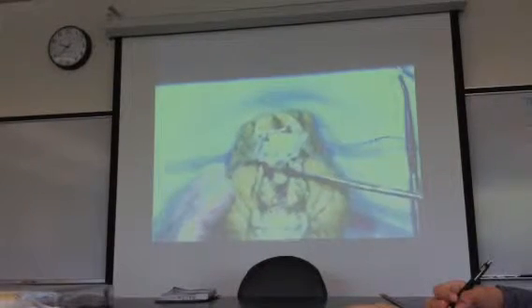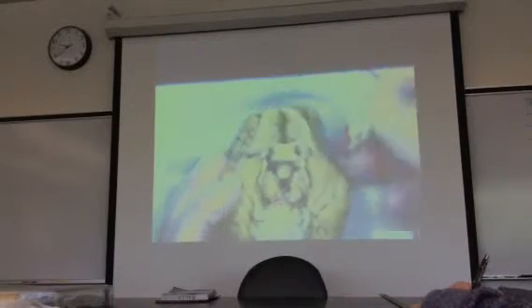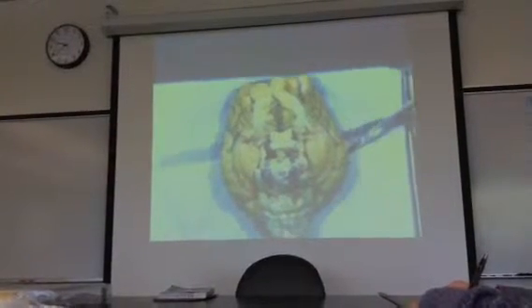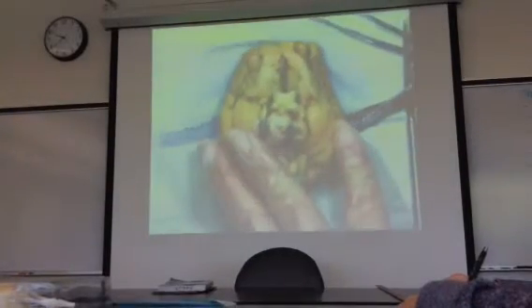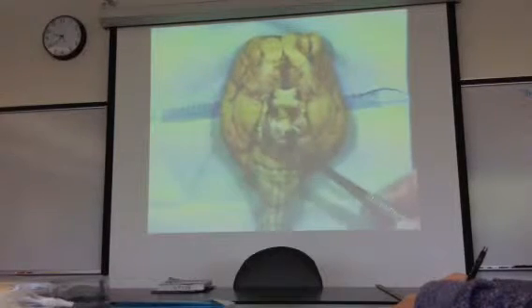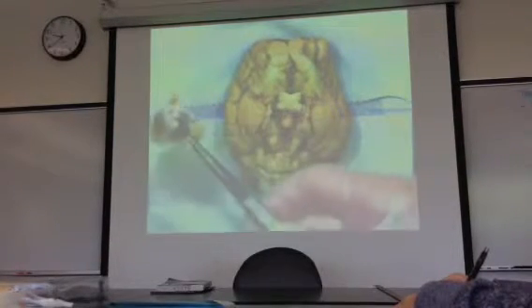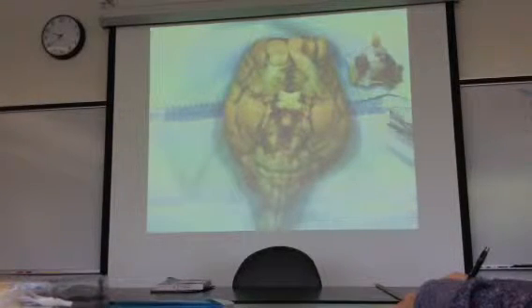Okay, this is where the pituitary attaches. You can actually pull that out, and it leaves a little hole behind. Okay, so this is what we took off. Move that up a bit now. Okay, this is what we took off. That can go in the trash or you can save it if you want, okay?